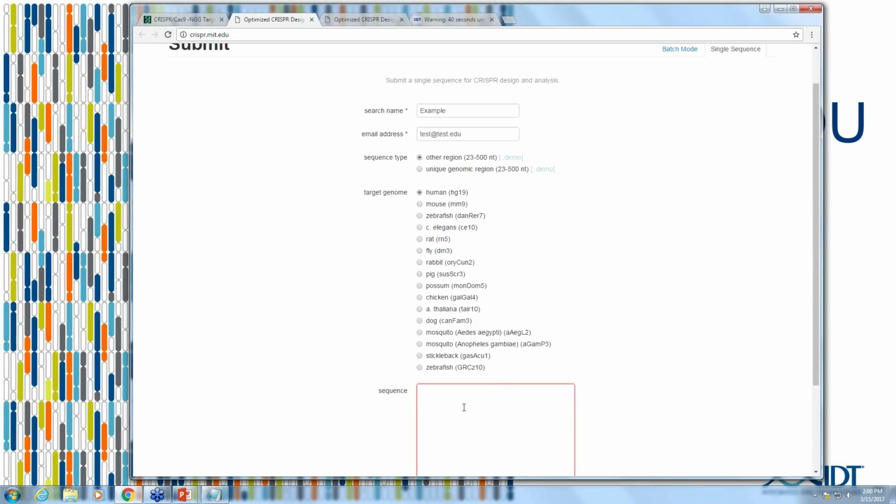Okay. And then this is an interesting question, working backwards a little bit. If somebody finds a published guide RNA and they want to come back and see what off-target tools something like this might predict, is there a way to do that? Yeah, that's a great question, and actually I really like that you can do that with the MIT tool. So the one thing that you will need, and I've been able to do this, is to put in that 20 base sequence and the PAM itself. So you'll need the NGG, or whatever the N is.